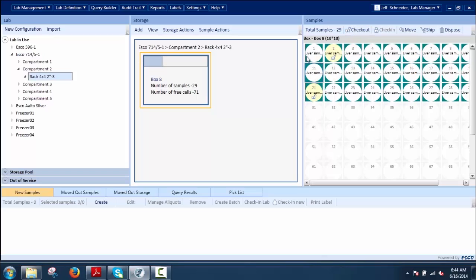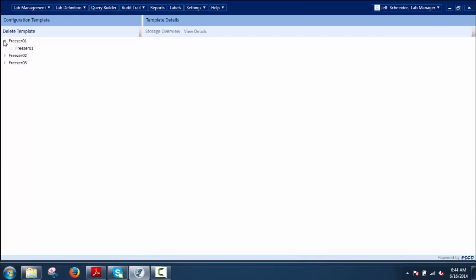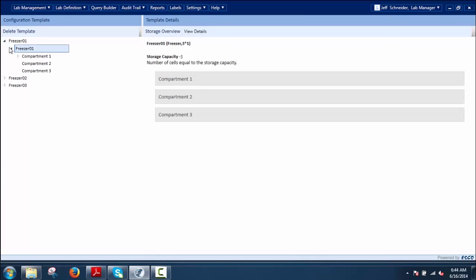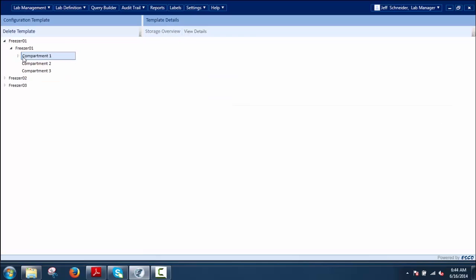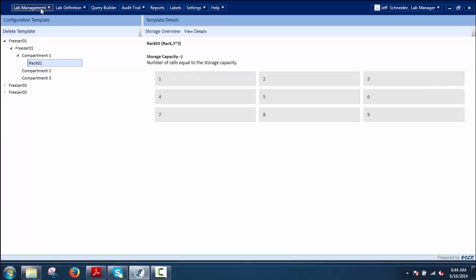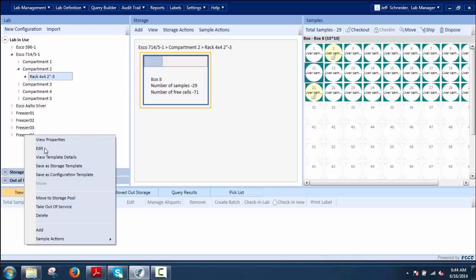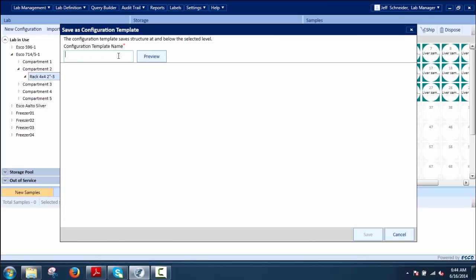Under Configuration Templates, this is a tool for users to create storages in the lab by saving hierarchies as a configuration template. Templates once created can be saved and are available for use through the New Configuration option. The user can navigate through all listed configuration templates and choose the proper configuration set to use. It provides details and layouts of all available storages.